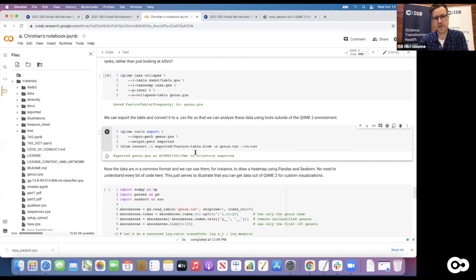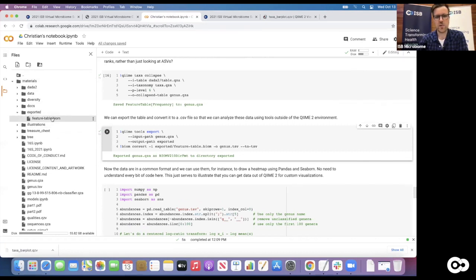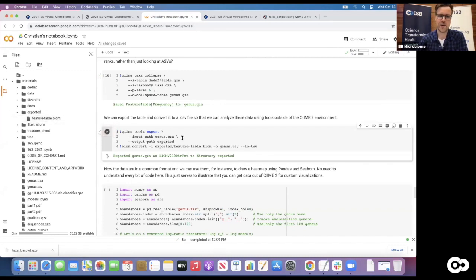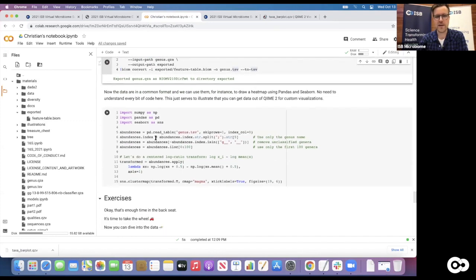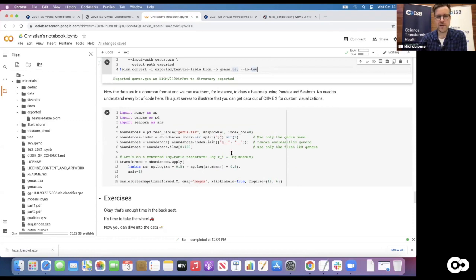So if you look at that exported folder, you see the genus.biom table extracted from the QIIME artifact - that's already significant because we got it out of the QIIME format into its native data format - and then we converted it to a tab-separated file. That can just be read with any tool. Here's a small example where I want to do a heatmap of that and also try a different normalization method that QIIME doesn't provide. It's not important to understand that code 100 percent - it's only to illustrate that you can get that data out into your own analysis or visualization pipelines.